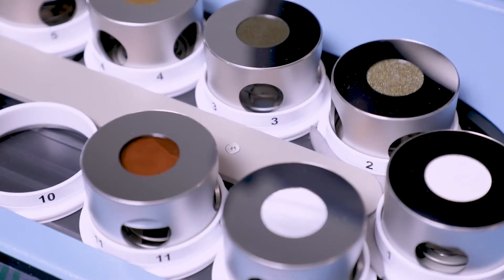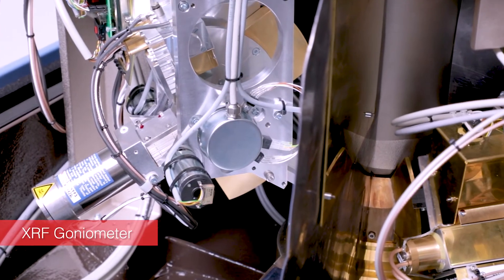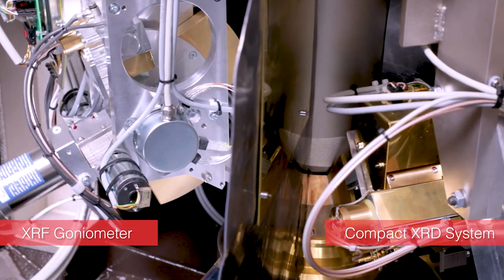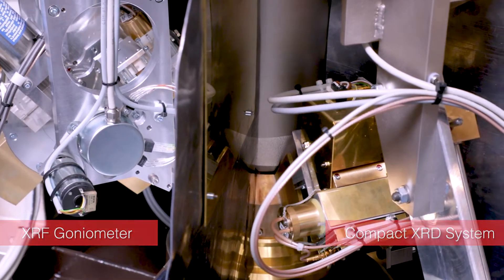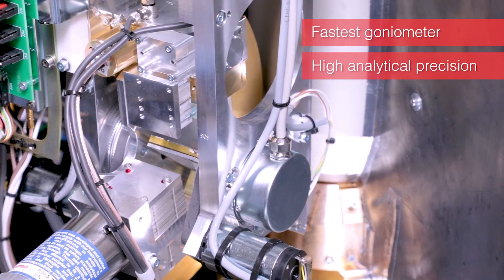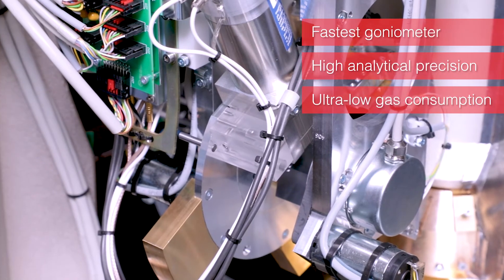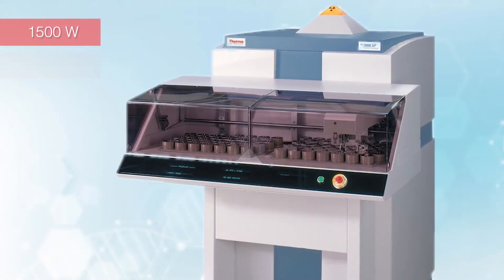XRF analysis determines the elemental composition of a sample, but does not provide information about how the elements are combined together. Such mineralogical information is only available through X-ray diffraction. Therefore, combining the results of both XRF and XRD techniques allows for a better and more complete characterization of any given crystalline sample.